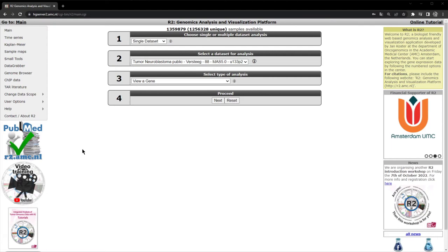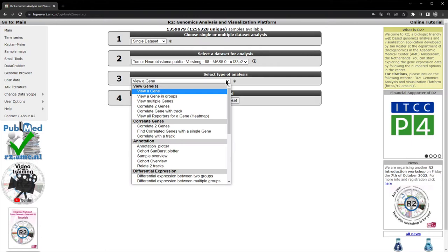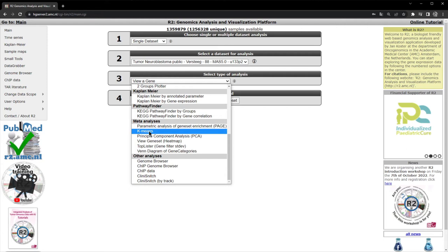In this module, we're going to be looking at using gene signatures and creating signature scores. To start with, we're going to be using the neuroblastoma dataset consisting of 88 tumors, and we're going to look at an analysis called k-means clustering. Under type of analysis, go down to meta-analysis, select k-means and click next.